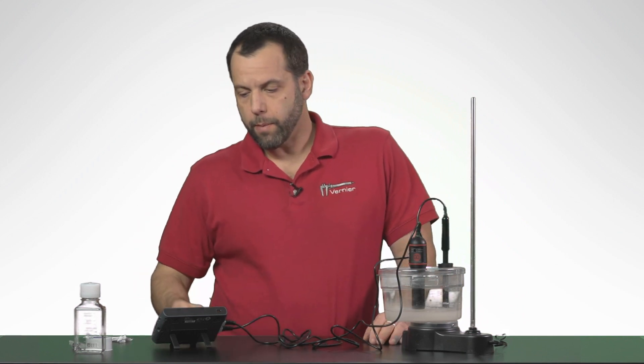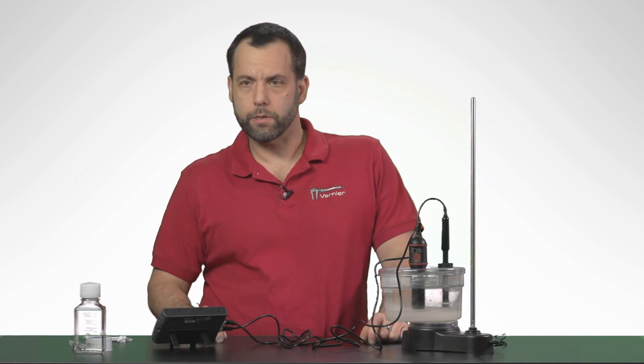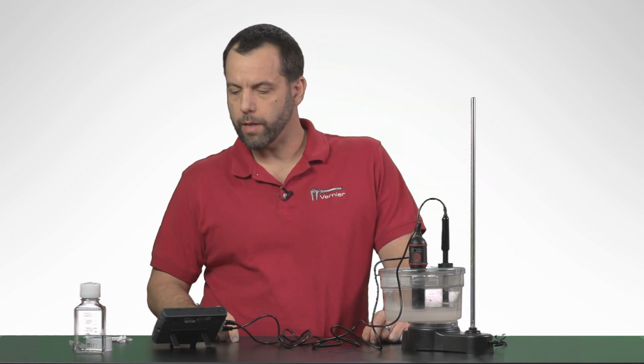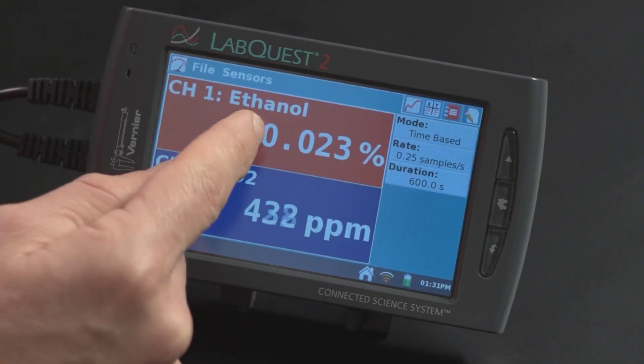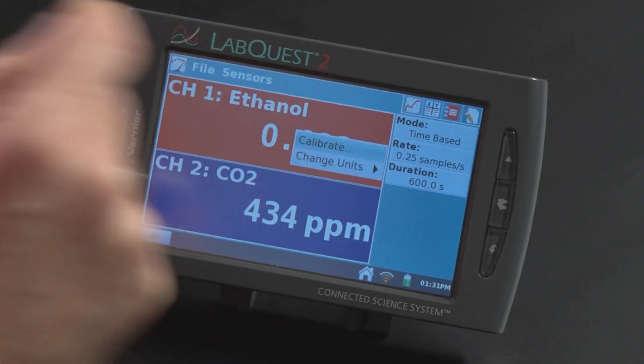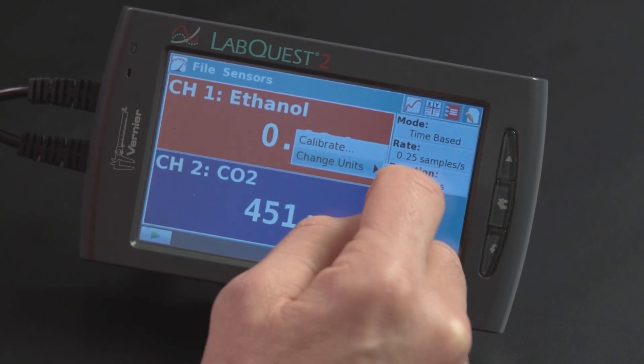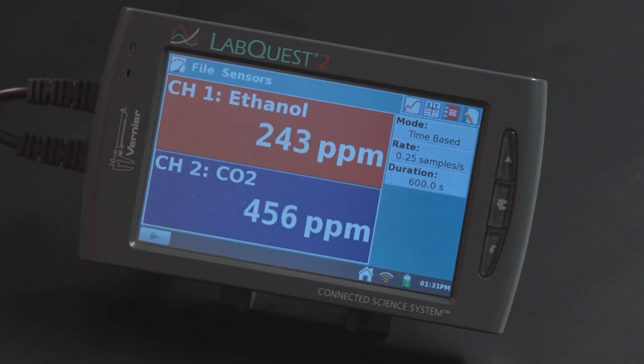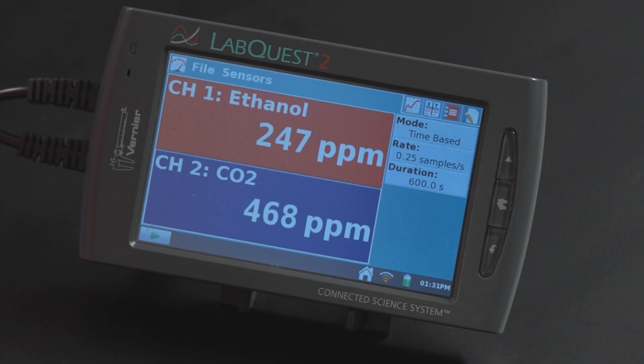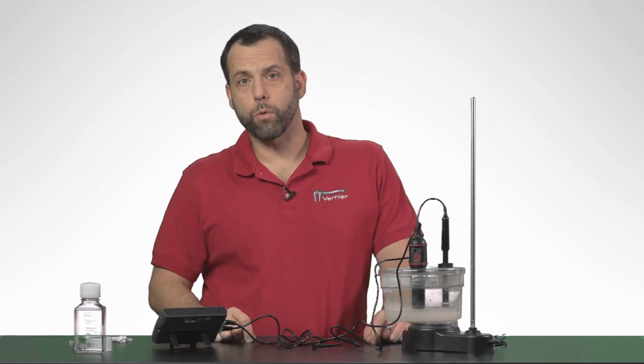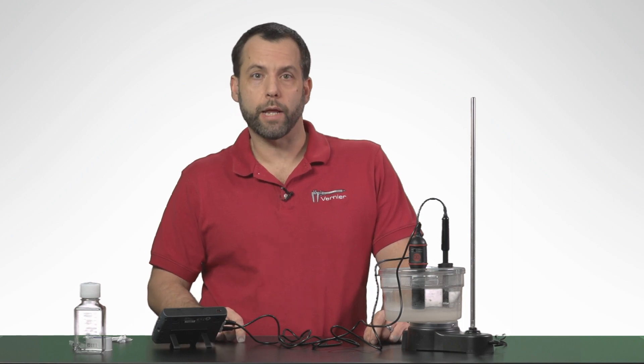And really now the only thing that I'm going to do is I'm just going to change the units. I like to have the same units for CO2 and ethanol. You don't have to do that on the LabQuest, but I like having them both read in PPM. So I'm just going to tap on the meter where it says ethanol, and I'm going to change my units to PPM. And then if you wanted to, you could begin recording right now. Normally it would be best to wait just about 2 or 3 minutes. But I have this whole file set up to record for 10 minutes. So why don't I just hit collect now, and we'll see what happens over the next 10 minutes.